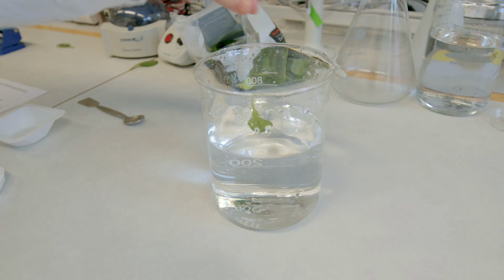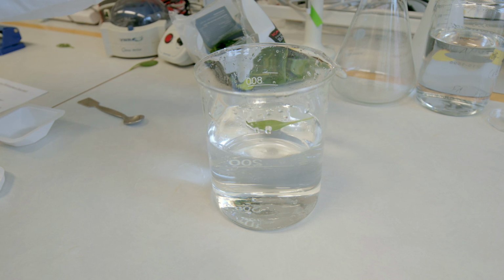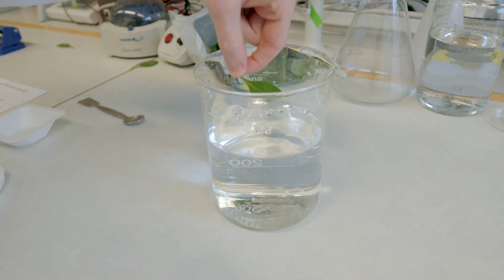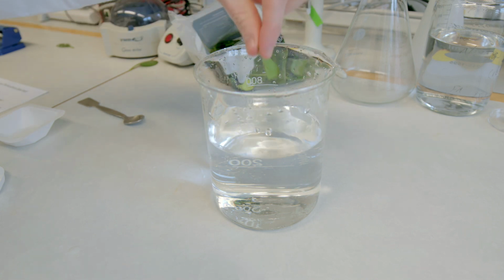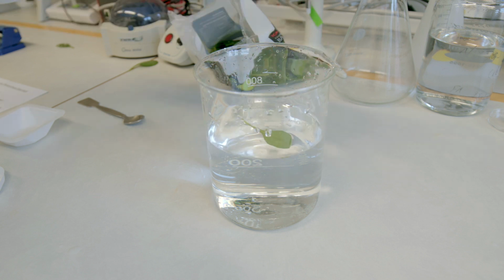If we take a baby spinach leaf and we place it on water, it floats. This is because one of its tissues, called mesophyll, contains a spongy structure that traps air and makes the leaf less dense than water. If we replace that air with water, we can first make the leaf sink, and then use the spongy tissue to trap the oxygen released by photosynthesis until the leaf starts to float again.